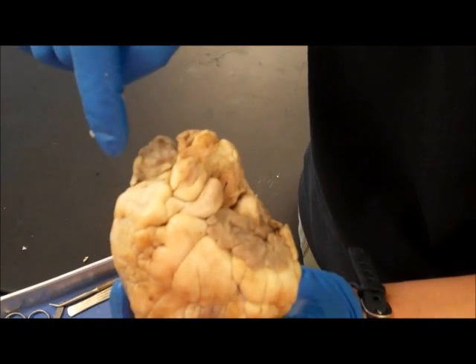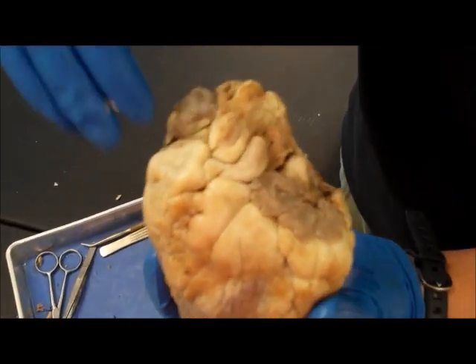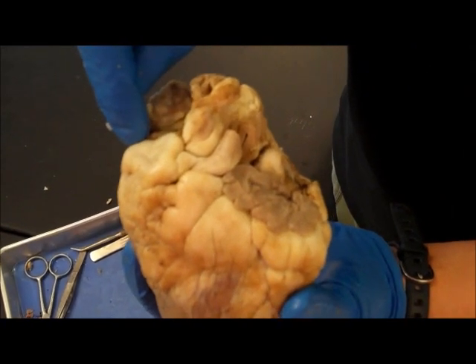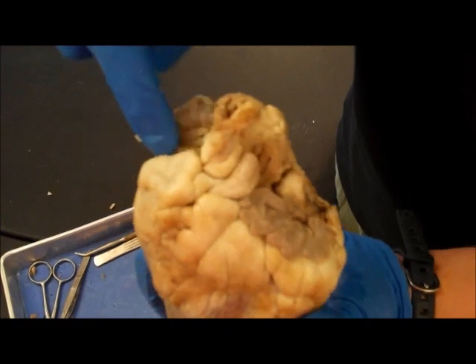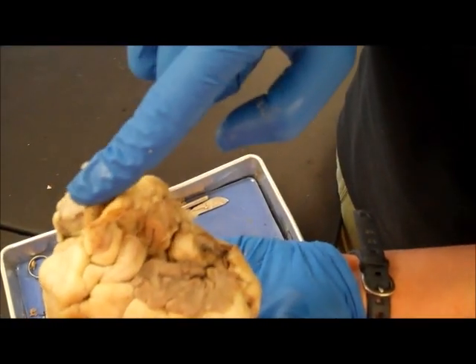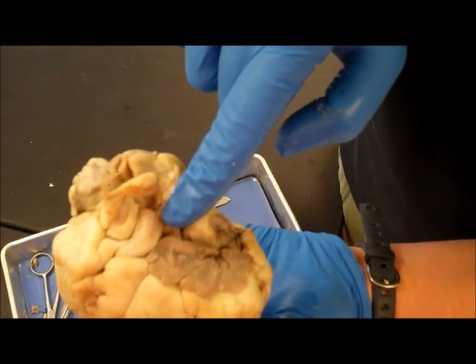Okay, so what we've done here is we have made our cut into the heart, and we started over here on the right atrium. We went across the right atrium, across these vessels here, which we're going to get to in a few minutes.